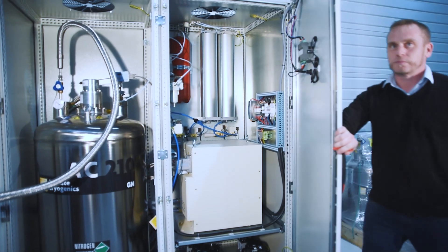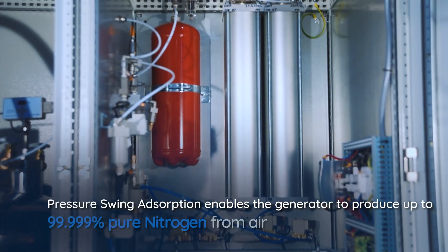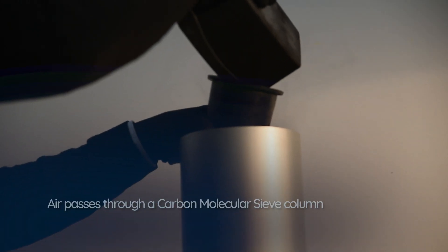Pressure swing adsorption enables the generator to produce up to 99.999% pure nitrogen from air.